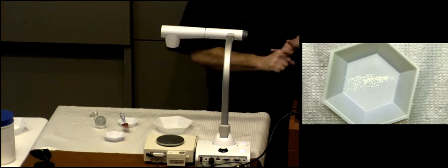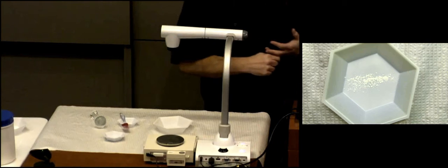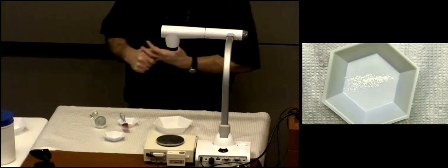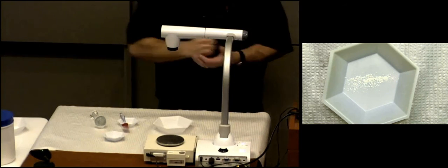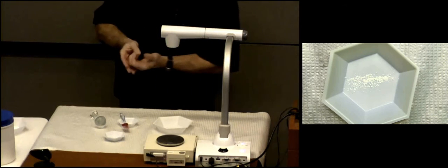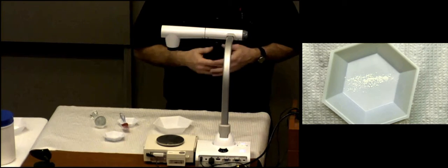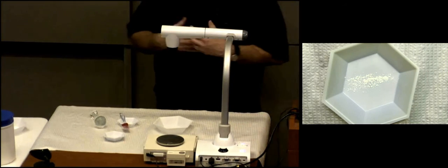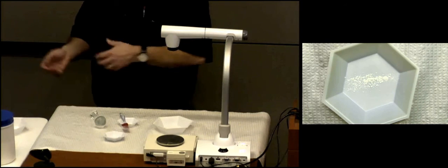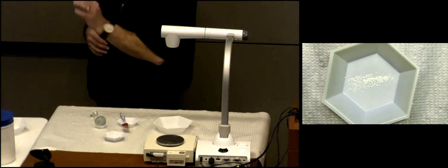Okay, so we have light yellow, odorless, particle size. How would you describe the particle size? Is it coarse? Is it granular? That would not be a good final product, right? What did you do to make sure that your texture in the very end is fine? So I would call that a fine, meaning a small particle size, so describe it as a fine. And then free-flowing powder. Just use that term, free-flowing powder. So this is a light yellow, odorless, fine, free-flowing powder.